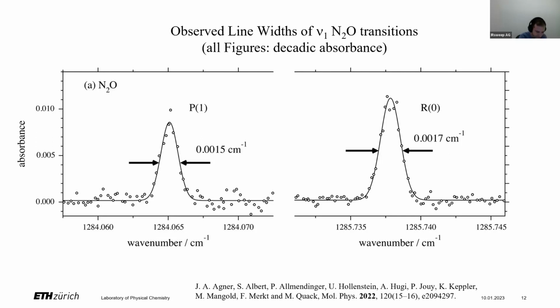That question was closely related to what we just answered. Exactly, 0.1% absorbance is a typical noise level, but it really strongly depends on your time integration and your co-averaging. The lowest noise levels that we have shown in time resolved measurements were in the 10 to the -6 absorbance units range, but that was thousands of measurements co-averaged. So it depends a lot on your system.